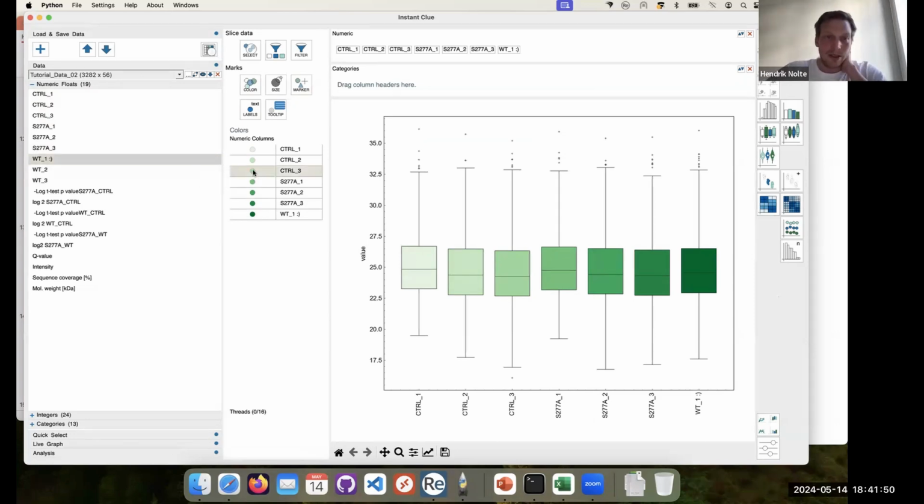Okay, so this is what we can very easily do if we can upload the data, and that is sometimes the detail in getting the data into the software, especially if you're from Germany, you probably have decimal points divided by a comma, and this is already a problem for the software.